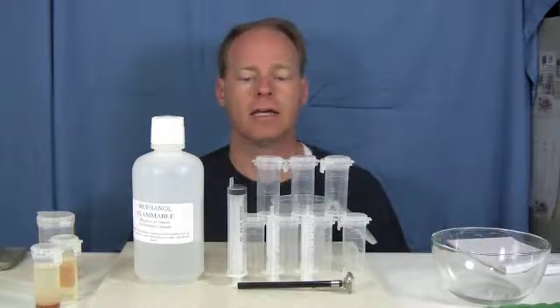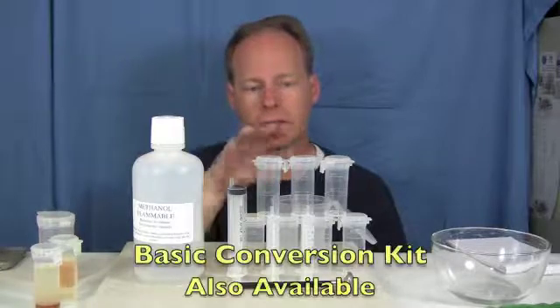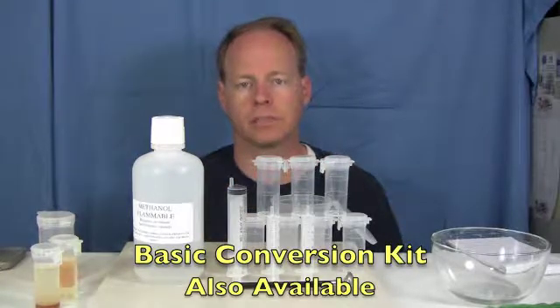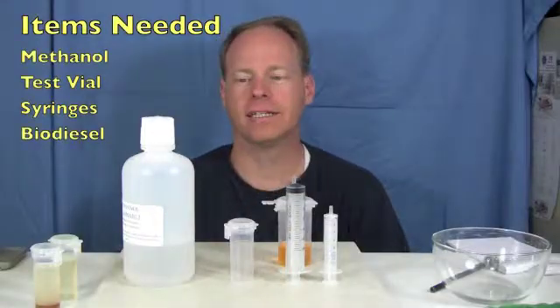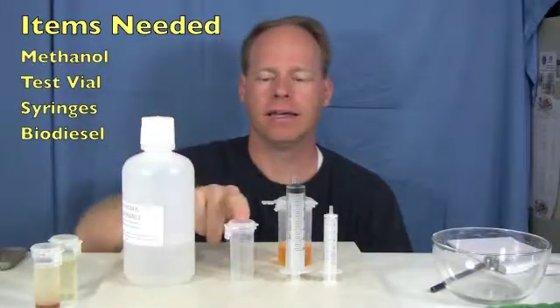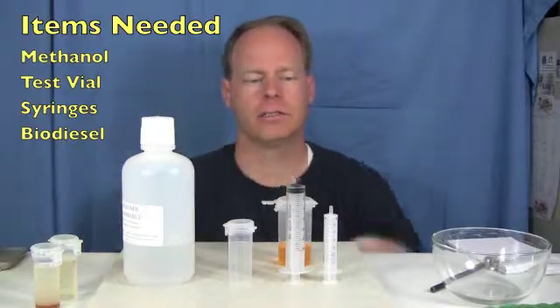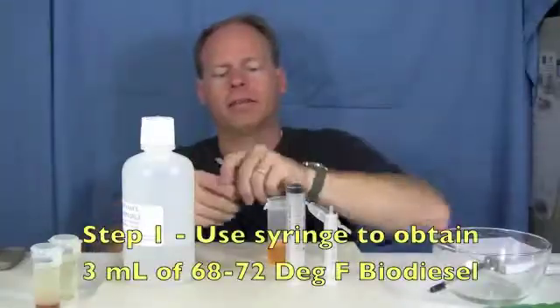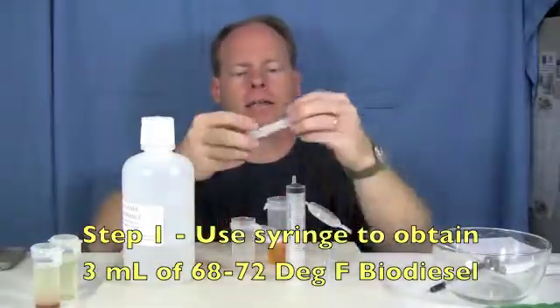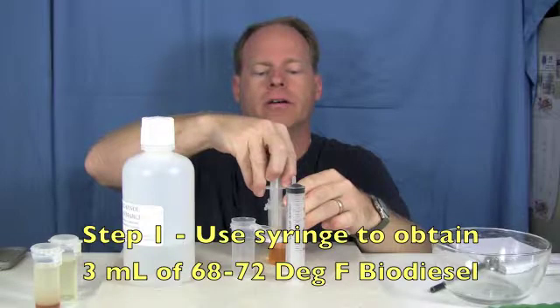We're actually going to do the test in this vial. This is our deluxe biodiesel conversion test kit. We also have a basic one which is just three vials and a couple syringes as well. To do the test with this kit, we're going to need methanol, a vial that's about 38 milliliters, our 30 milliliter syringe, our 10 milliliter syringe, and some biodiesel that we want to test.